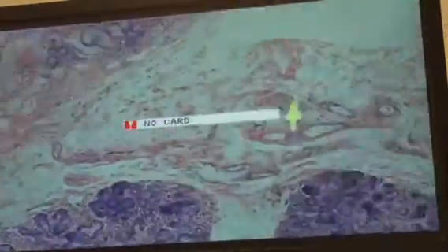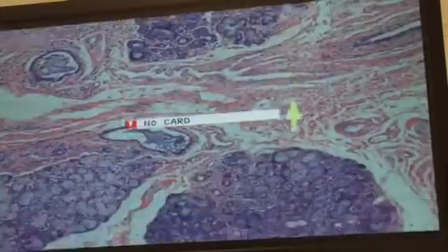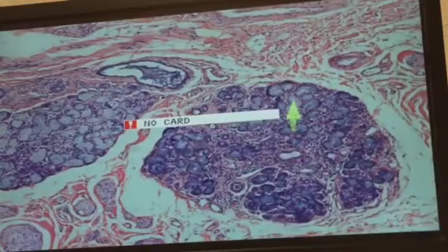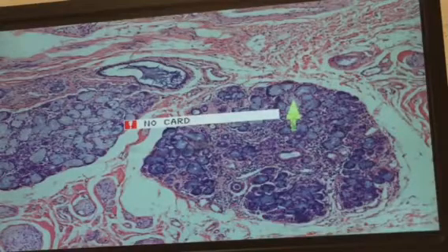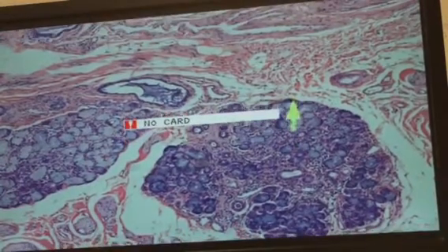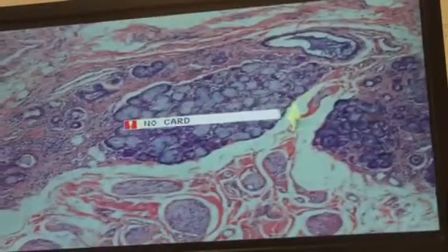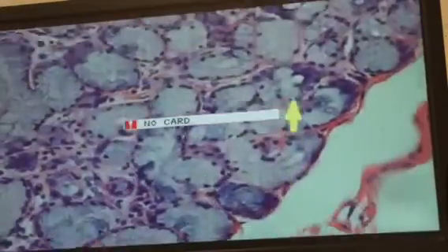So we'll stick over to the other side here. And even though this staining is a little on the dark side, we have almost entirely mucus-secreting acini. There are occasional serous demilunes, as we see right there. And over here. But almost entirely mucus secretion.